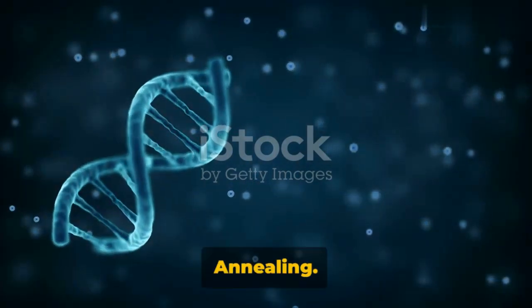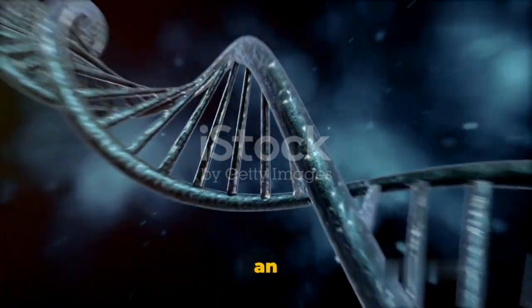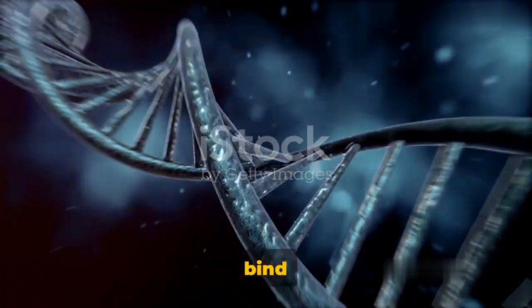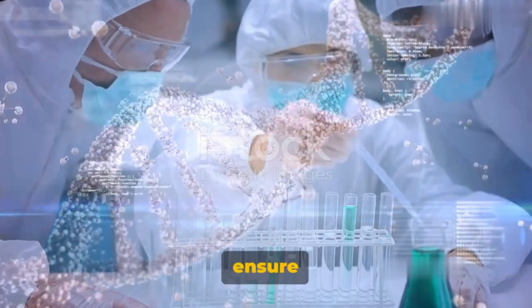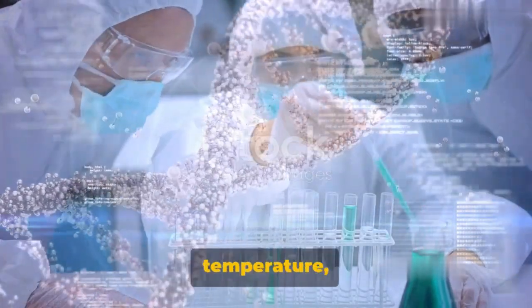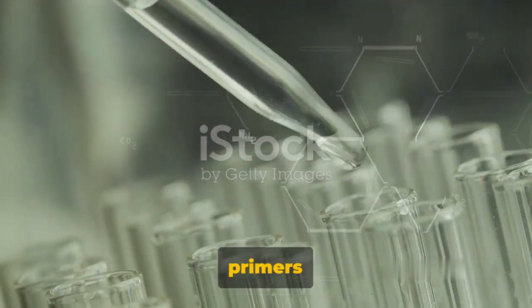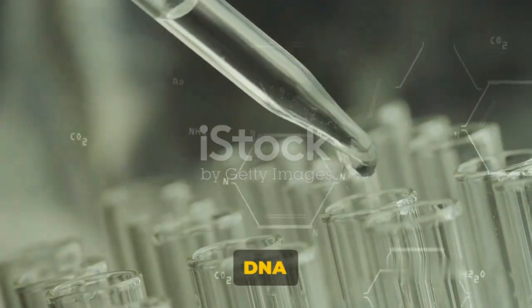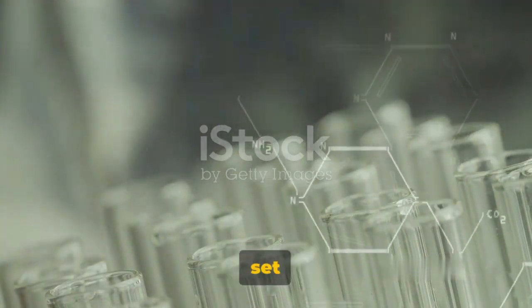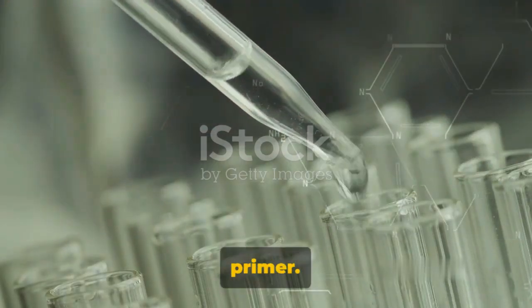Next, we move on to annealing. During this phase, complementary sequences have an opportunity to hybridize or bind together. To ensure this happens, we use a temperature that's based on the calculated melting temperature, or TM, of the primers. Think of primers as the starting point for DNA synthesis. We generally set the temperature 5 degrees Celsius below the TM of the primer.